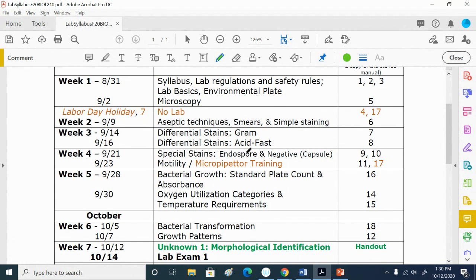We also use motility agar and look to see if the bacteria migrated from the stab. And there was something in the agar that helped us to see them. What was in the agar? Remember it turned red? TTC. Right, the TTC, the triphenyltetrazolium chloride. It was just there to help us see where the bacteria were. Right, so if they spread out from the stab, they're motile. If they're still in the stab, they're non-motile, right?